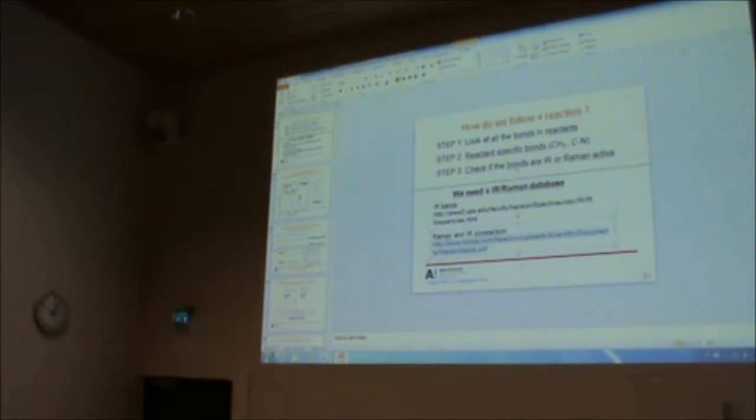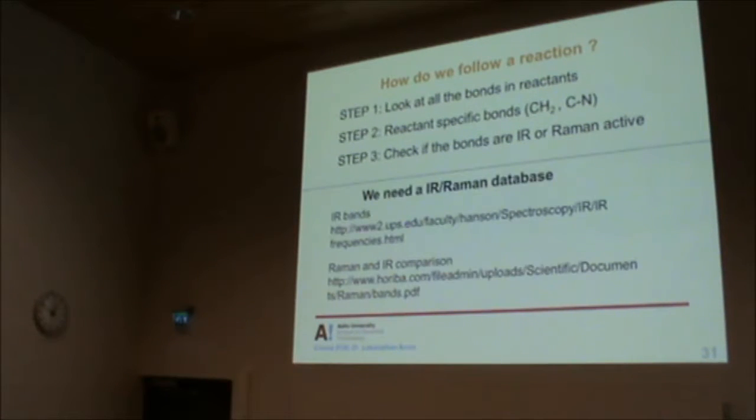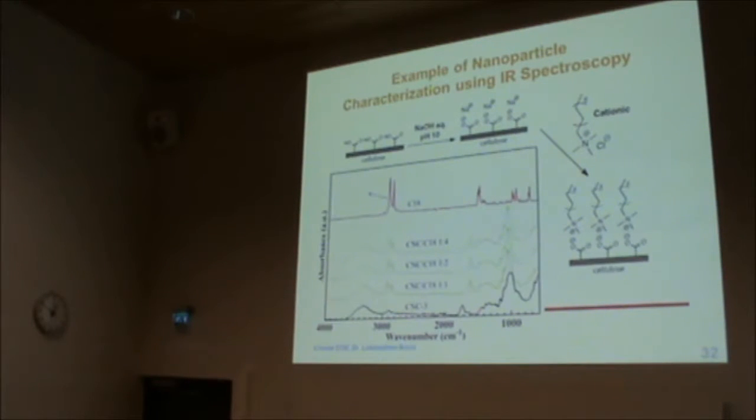So you have a comparative peak intensity here. In our previous slide, you had two examples, two differences: CH2 and CN. CN is either weak or medium, but the CH stretch was very strong.